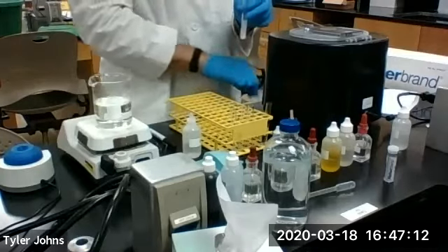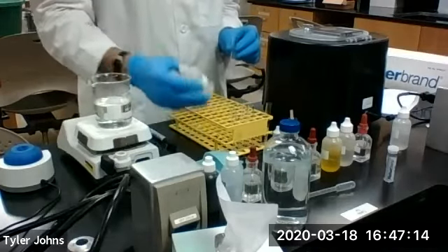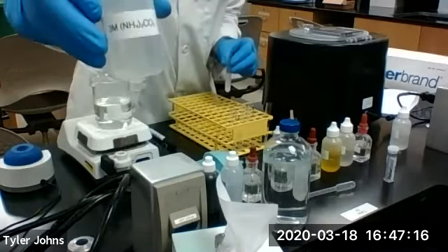Now that we are just basic, we're going to add 1 ml excess of the 3 molar ammonium carbonate.